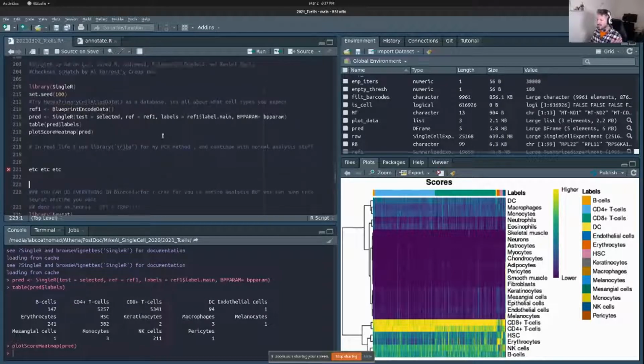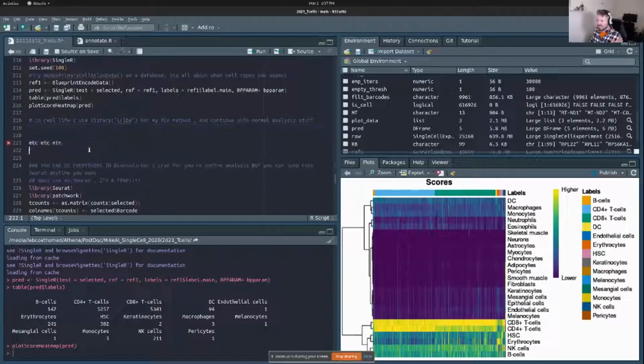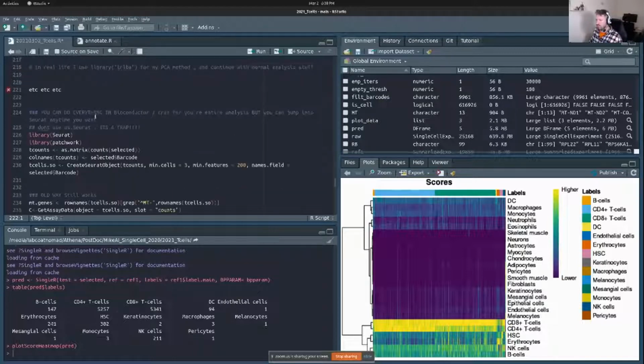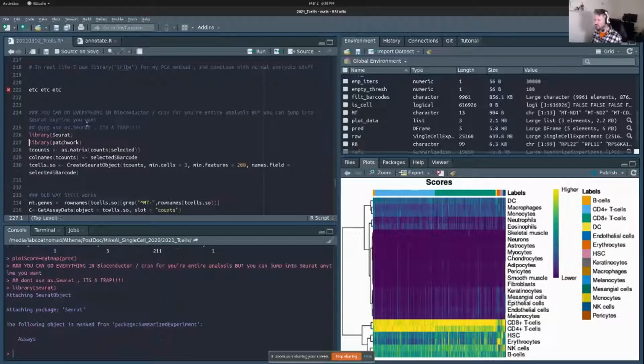And then basically you can do everything else you can normally do. This is everything else you can possibly want to look at. You can look at it in single cell that we've already looked at, that Henry's already showed. But what I want to show right now, if I have time, Henry, is really quickly that anywhere in your pipeline for single cell experiment, you can jump into Seurat. You can do it 50 steps down, or you can do it 2 steps. You can just do that empty droplet thing and then jump straight into Seurat if you want. It's really stupid easy.